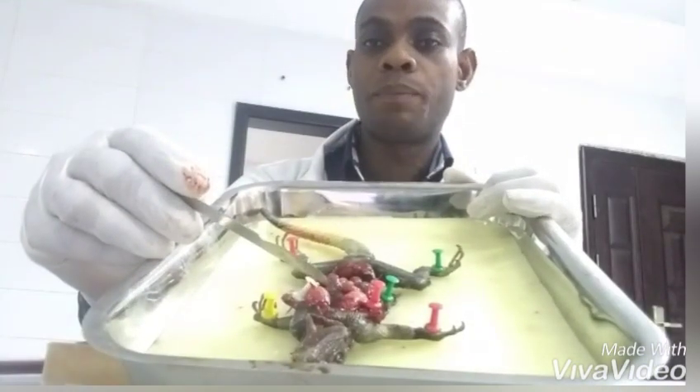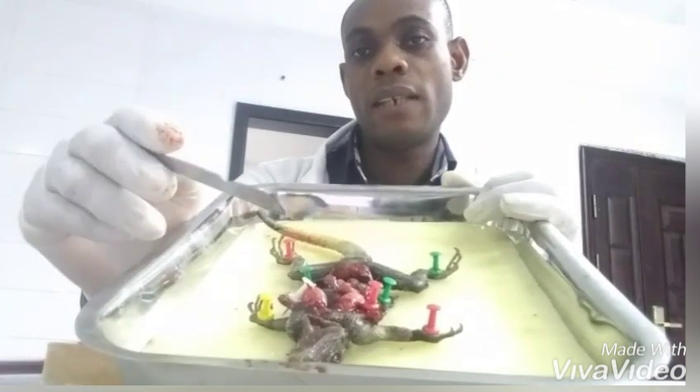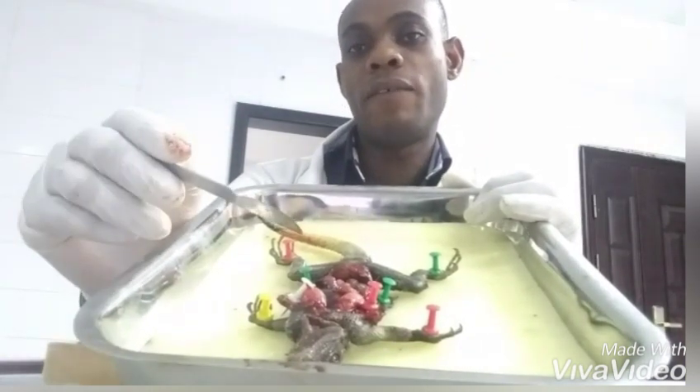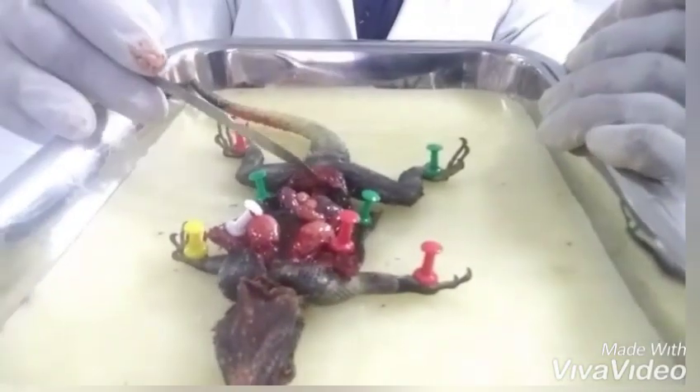The heart of the lizard has three chambers. There is a right atrium and a left atrium, and then an incomplete or partially divided ventricle. This ventricle is the aim of our dissection.